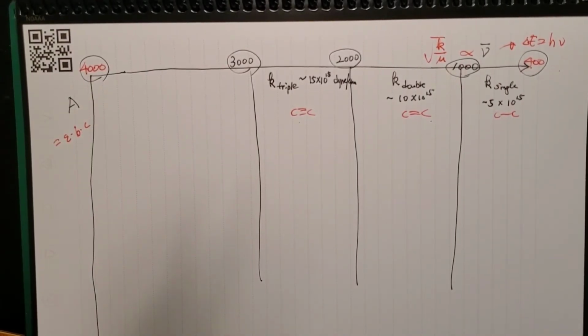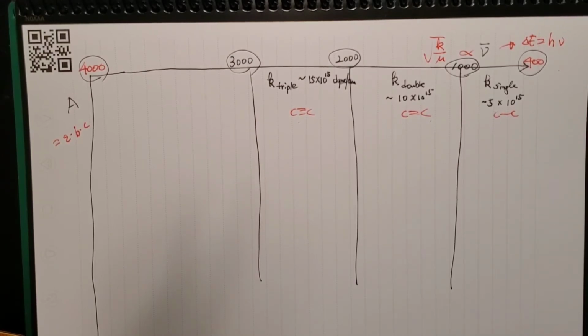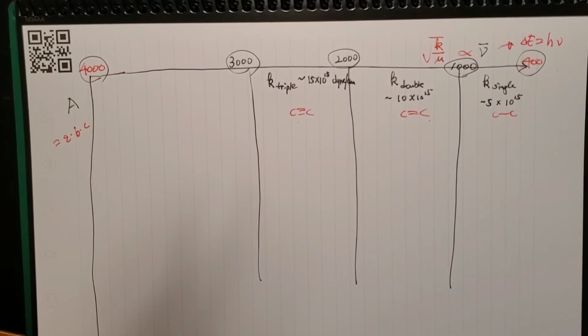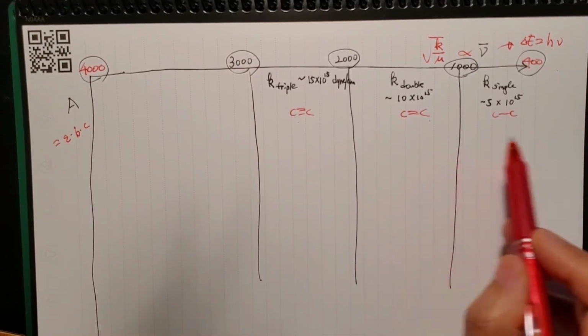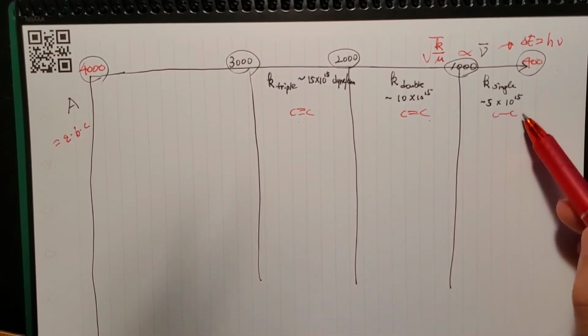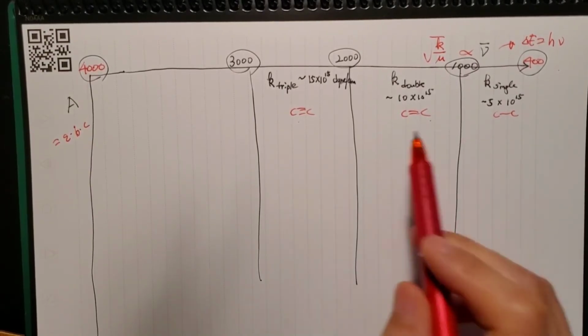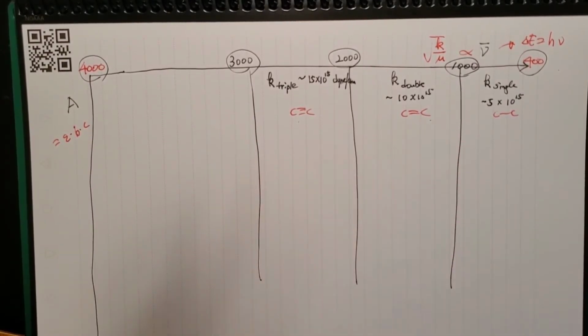However, you should not think of it strictly that way, because a carbon single bond is not as strong as a carbon-oxygen single bond. So there will be some variations, depending on the atoms. And that's true for the double bond also, and the triple bond as well.